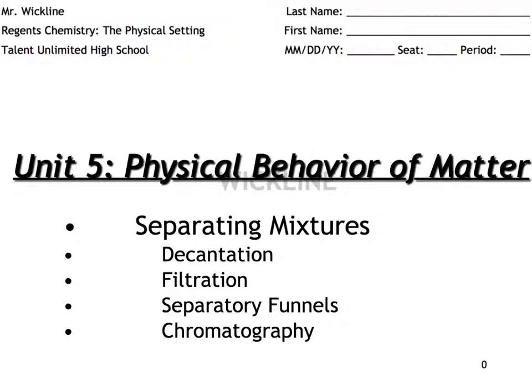Alright guys, in today's lesson we are going to continue talking about separating mixtures, but we're going to learn a few different procedures other than distillation today.